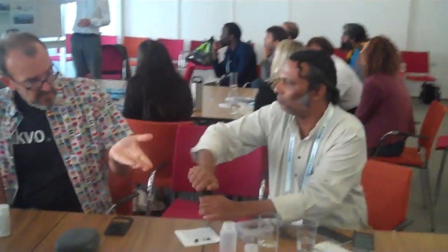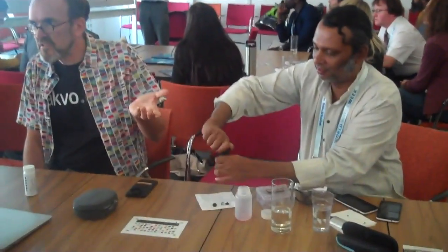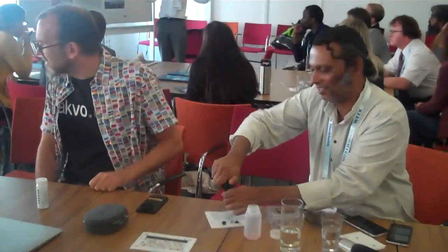You add an off-the-shelf reagent to the water sample and it colors the sample, depending on how much fluoride there is in it. This is a spiked sample, because there's no fluoride in Stockholm of any meaningful level.